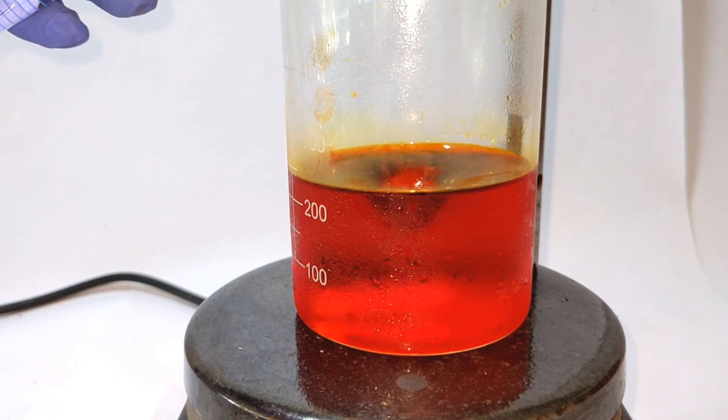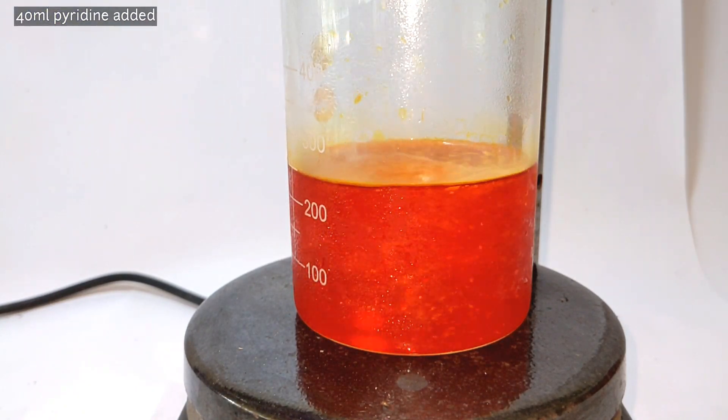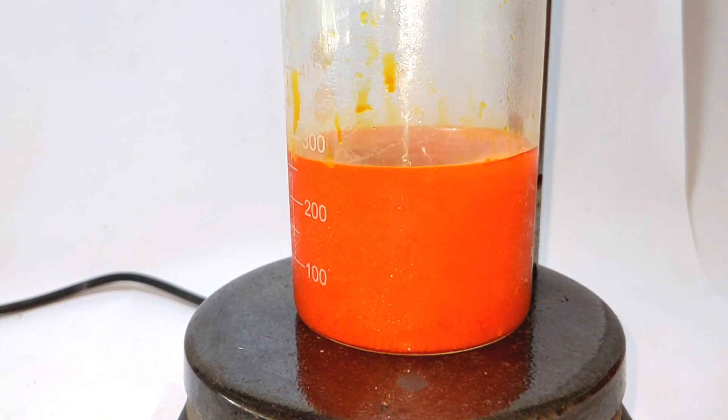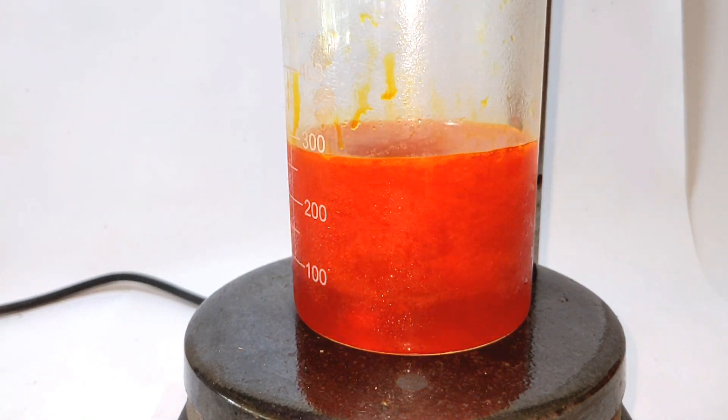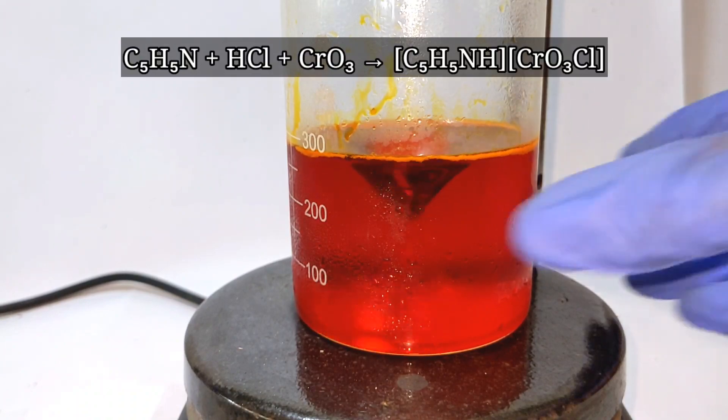After cooling down to 0°C, slowly add 40 milliliters of pyridine, which was already pre-measured in a measuring cylinder. Immediately you can see the formation of an orange precipitate crashing out — this is the pyridinium chlorochromate precipitating out.